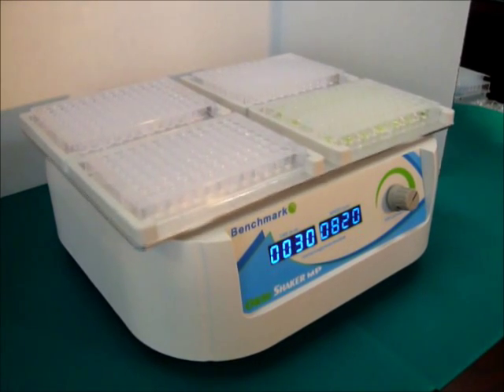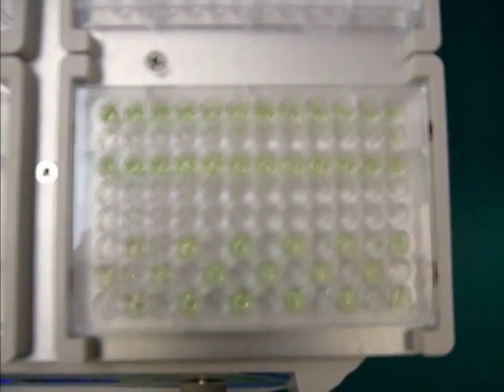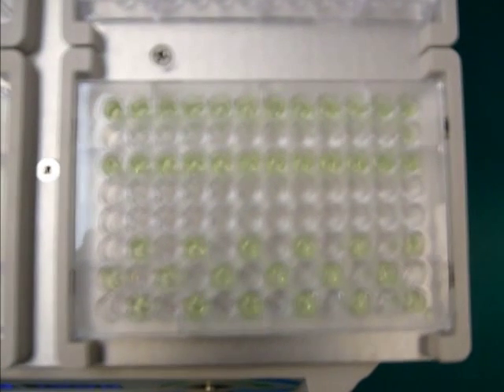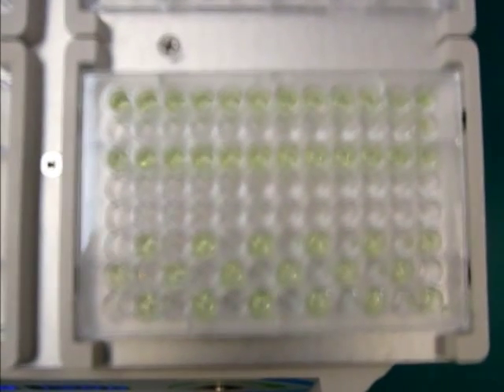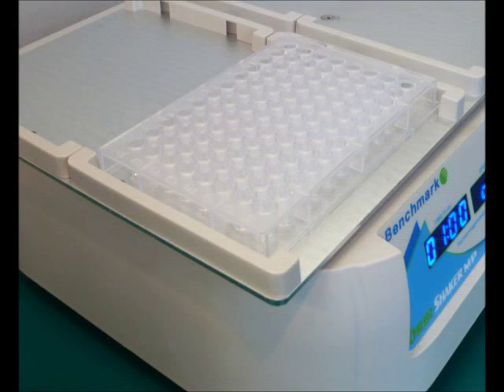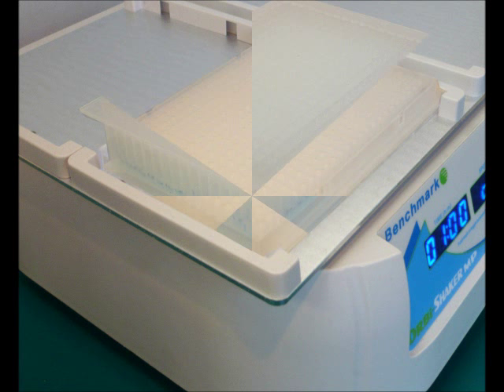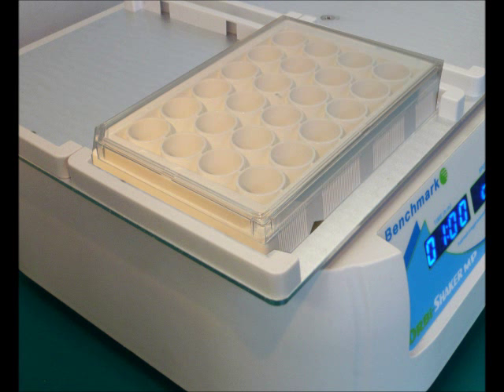A compact 3mm orbit provides the necessary mixing action to produce sufficient mixing. In slow motion, we can take a closer look and observe a vortex produced in each well of the microplate. Most commonly used for mixing in 96-well assay and PCR plates, the Orbi Shaker MP is also ideal for a wide variety of plate types.